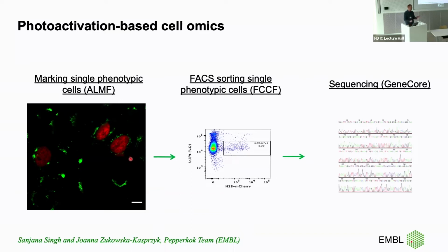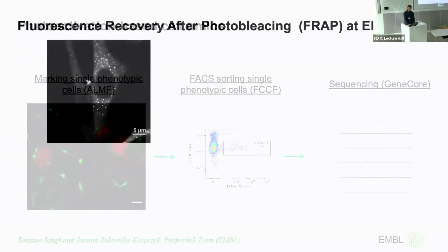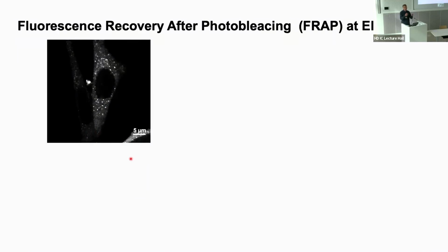So in this case, one can think it's rather easy. I need just to photoactivate cells in the given field of view and then go to the next field of view. Let's look at a little more complicated example. We use the photobleaching functionality, but in this case as a FRAP experiment. I'm interested in studying the dynamics of small structures which recover rapidly, doing FRAP. How would I do it manually? The classical way on a point scanning confocal microscope is to define your imaging conditions, with which you can catch your desired time resolution, right? Then define the region and start the bleach experiment.